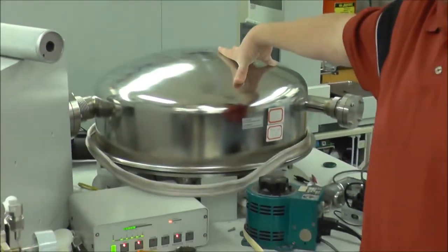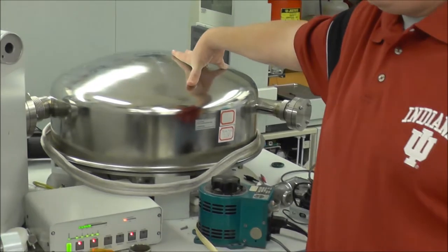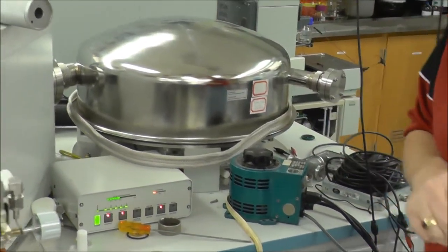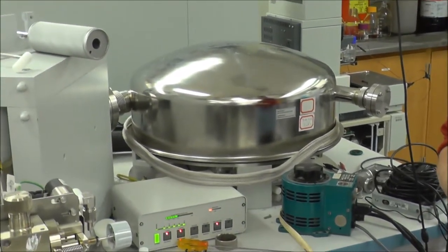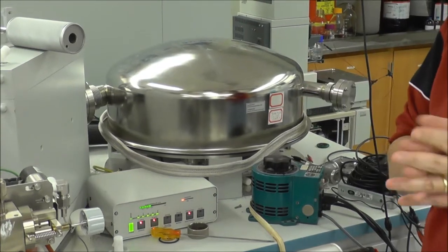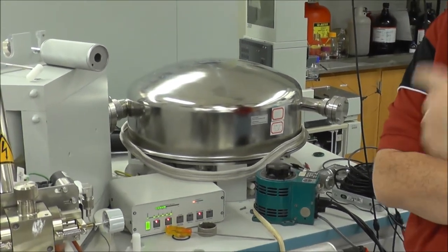It is literally what we call an electron multiplier tube. So the ions hit it, they give off electrons, and we amplify them. Kind of like somebody added a CCD inside your little camera there, except it's got 2,000 volts on it.